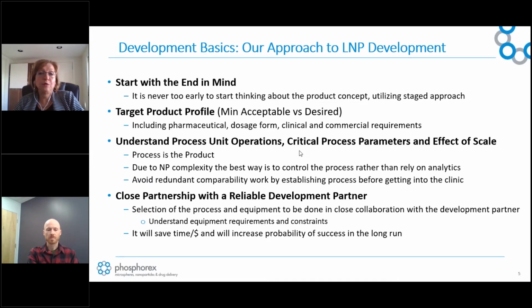So for example, stability of the LNP formulation, we propose to use as one of the criteria for the lead formulation selection. We've seen some cases when instability was discovered very late in the process and the partner needed to go back and reformulate.